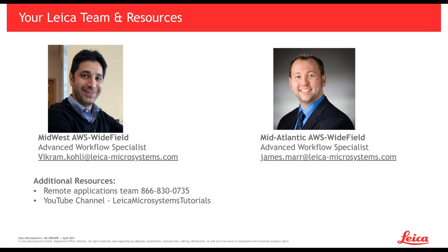And what does SVCC and LVCC vary in the order of deconvolution and ICC? Yeah, so if we remember back, SVCC is our small volume computational clearing, LVCC is large volume computational clearing, and ICC is interactive computational clearing. And each one of these can be done independently, but it depends on a lot of different factors.